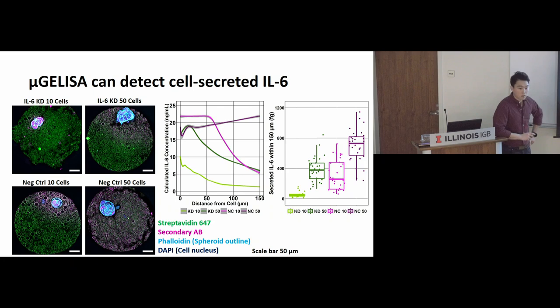So this is signal. Yeah, exactly. Okay. So everything has to be fixed. Mm. I mean, yeah. I guess you can do it while the cells are not fixed. Just introduce the antibodies. I don't know how much I recommend doing that, but yeah, they're fixed, and then it's a one-time experiment. And how do you wash? Do you need to wash in between? Yes.